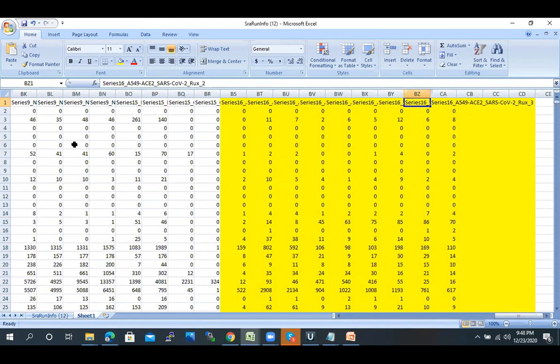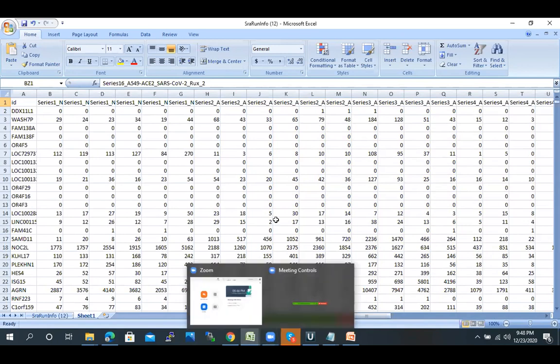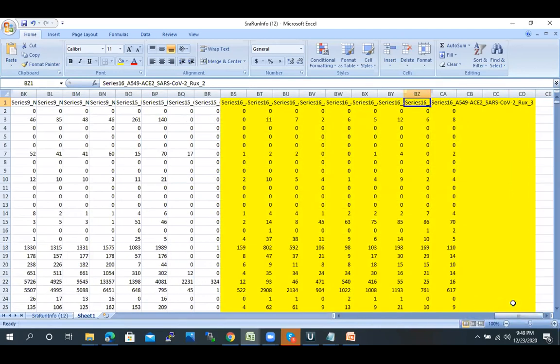Besides, we can process this table further. I have processed this data by removing all those genes which contain 0 value across all the samples. I have prepared a file with these 9 samples, and I have also removed all those genes which contain 0 value across all the samples. So I have considered only one drug treated data. You can consider any analysis that you want to perform.